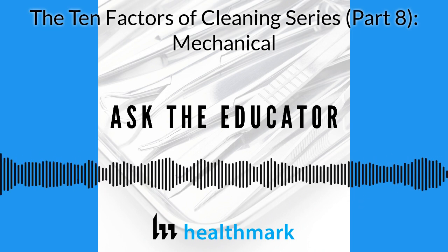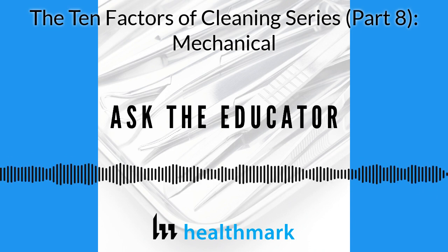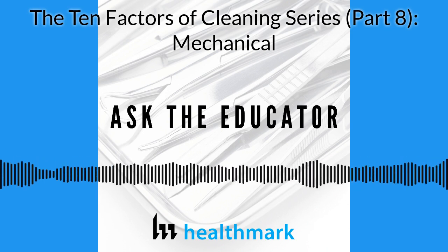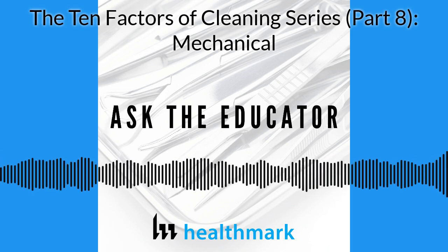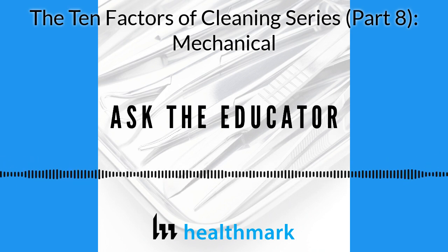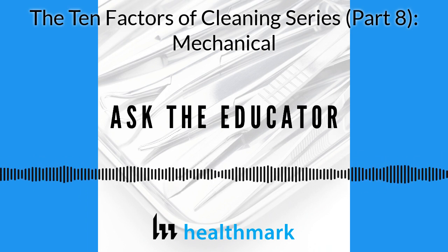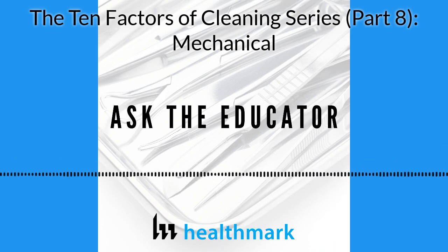All right, everybody, welcome back to our Ask the Educator podcast. This is Kevin Anderson, your host, and with me I have Stephen Kovach again. We're just getting through these 10 factors of cleaning series. Today, we'd like to cover the factor we oftentimes refer to as mechanical. Stephen, if you wouldn't mind, give our audience a brief introduction: what do we mean when we talk about the mechanical factor of cleaning?